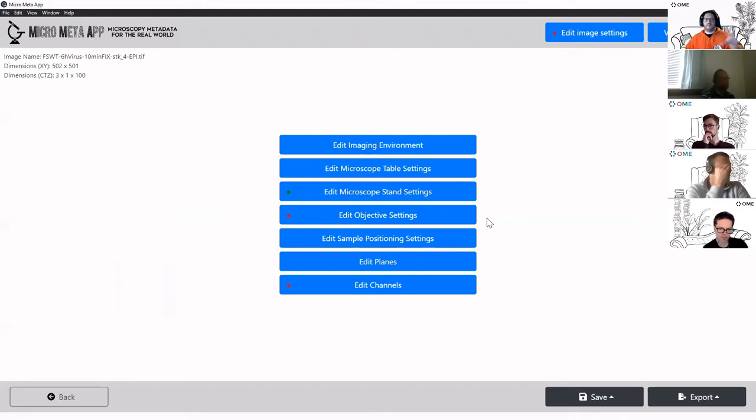All this data that you see in the fields is based on the model that BINA and the 4DN initiative are producing. And basically, it's automatically populated from the model. So the model comes in, it gets downloaded from the GitHub repository that we are using right now. So it's not extremely static. And the model is based obviously on the OME model as a source.